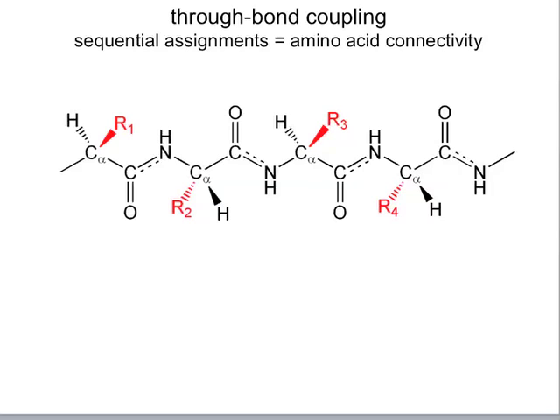So in this way, and I think you can see that this is a fundamentally different way of approaching the structure determination problem than X-ray crystallography. And it's complicated, as is X-ray crystallography, but complicated in a different way. And it's more of a bookkeeping problem. Onward.